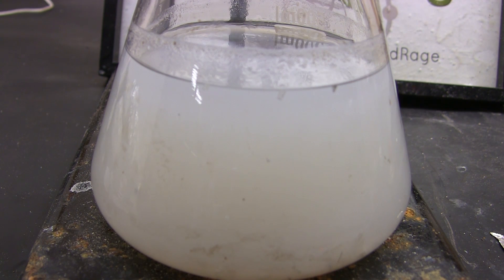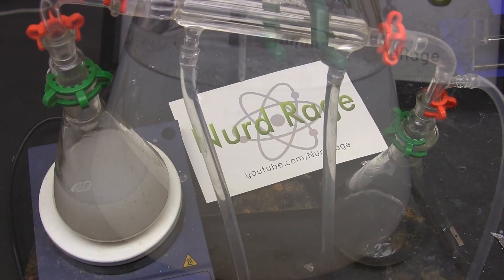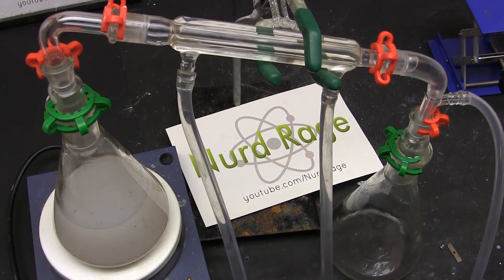Our reaction is done. If you have large amounts of solvent you usually put it on a hot plate and reflux for a few more hours to ensure all the water is destroyed. We now have a mixture of magnesium oxide and magnesium methoxide in what we hope is dry methanol. To isolate just the methanol, we rearrange our reflux condenser setup into a distillation setup.